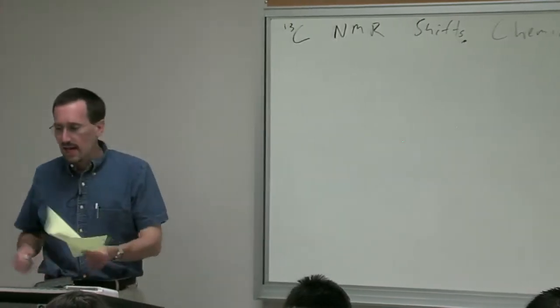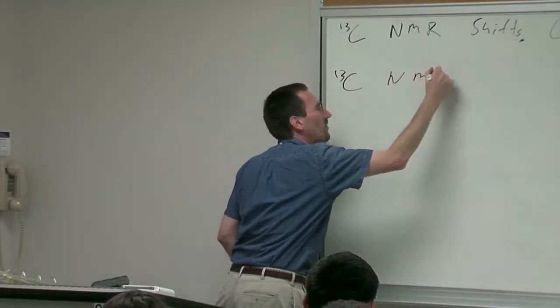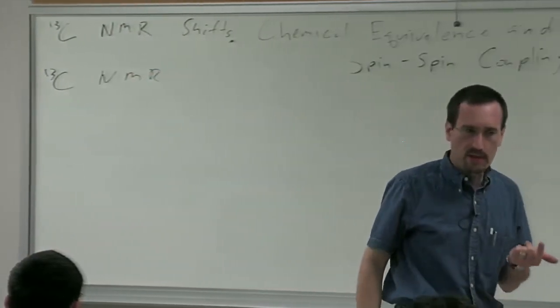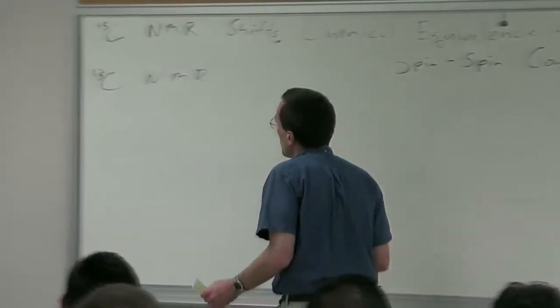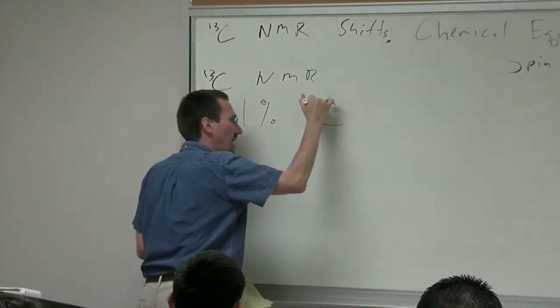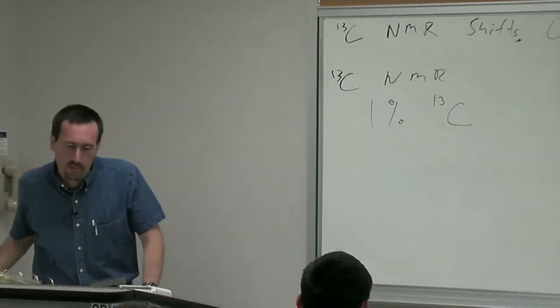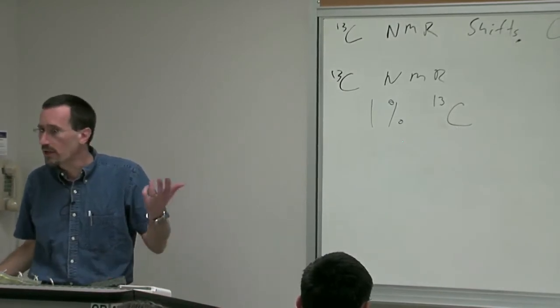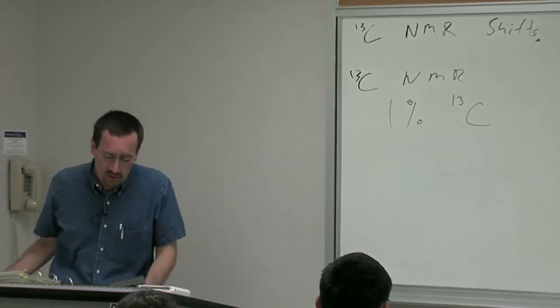All right, what do I want to say about carbon NMR spectroscopy, first of all? If proton NMR was difficult because you have a very small population between your alpha and beta states, carbon NMR is even worse. First, you know that carbon-12 doesn't have an NMR spectrum. It's not active. It doesn't have a magnetic dipole. And we only have 1%, or more specifically 1.1%, C13. So most of your molecules, for small molecules, don't contain any C13. Some of them contain one C13.